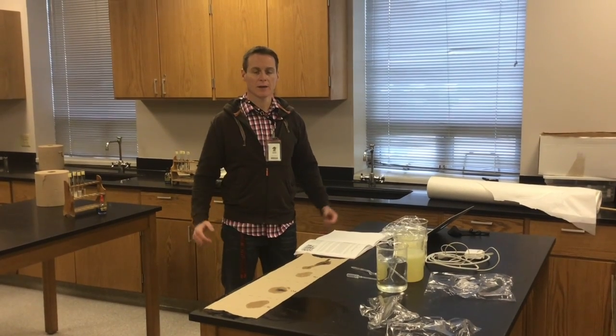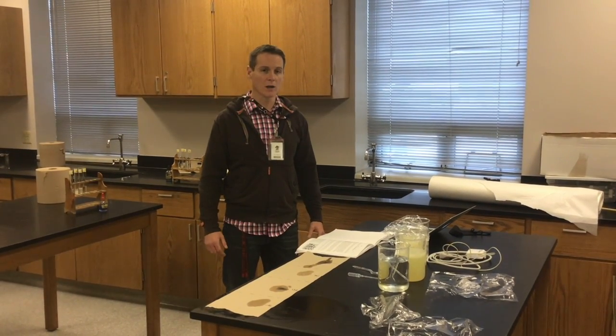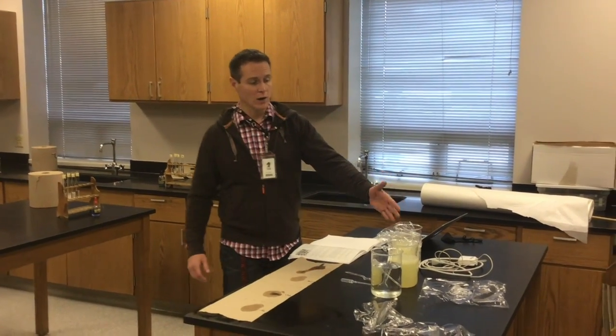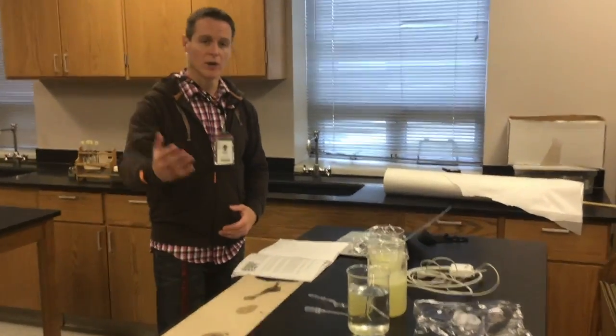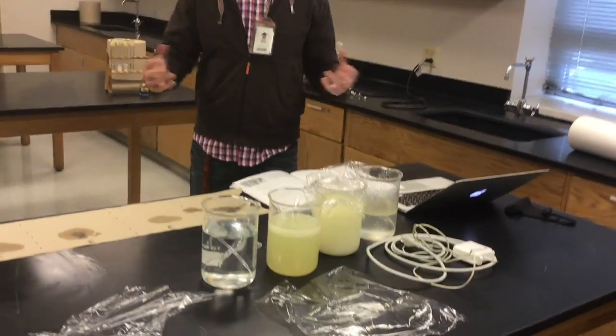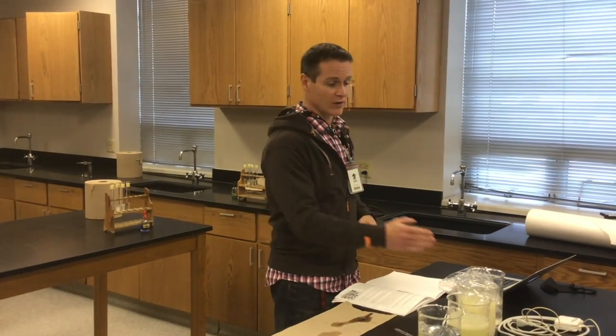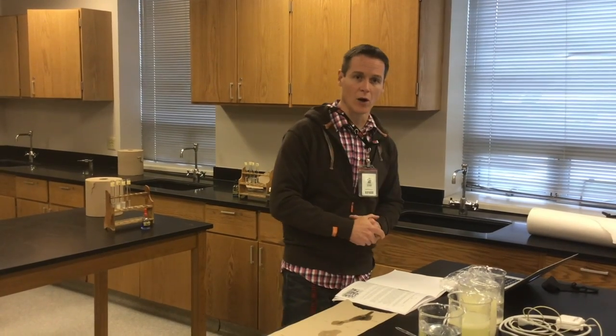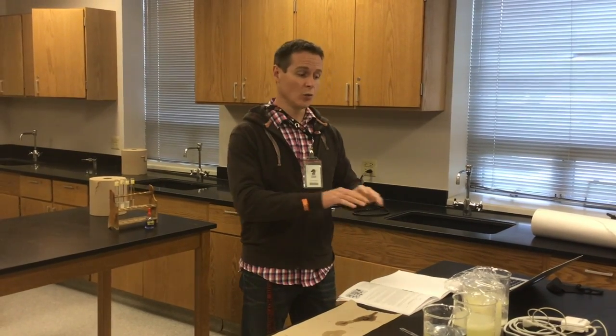Freshmen, we are going to be doing our Macromolecules Lab today, and we're going to be testing 4 unknown solutions. You guys should have read that we are zoo nutritionists, and some of the food got mixed up that is supposed to be fed to the carnivores, omnivores, and herbivores. We've got to feed them the right food, so we've got to figure out which macromolecules are present in each unknown. Then we can decide which food goes to which animal.